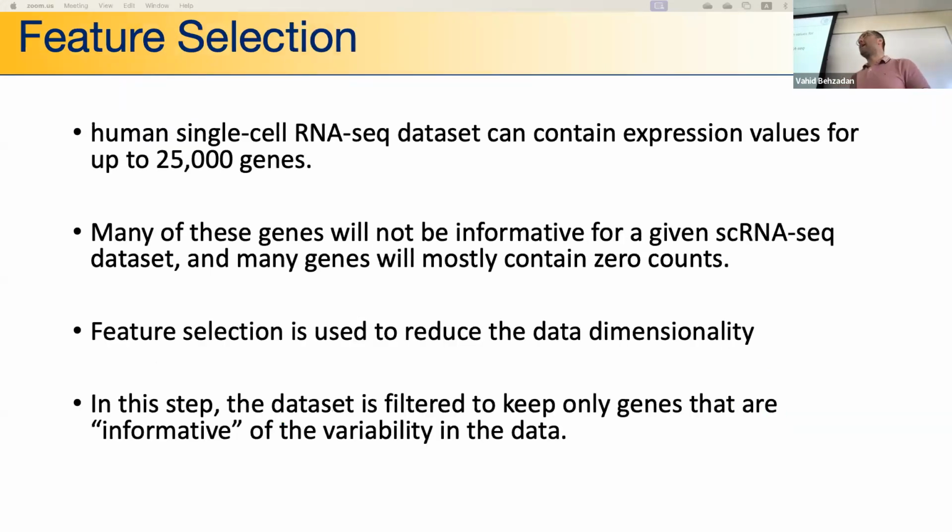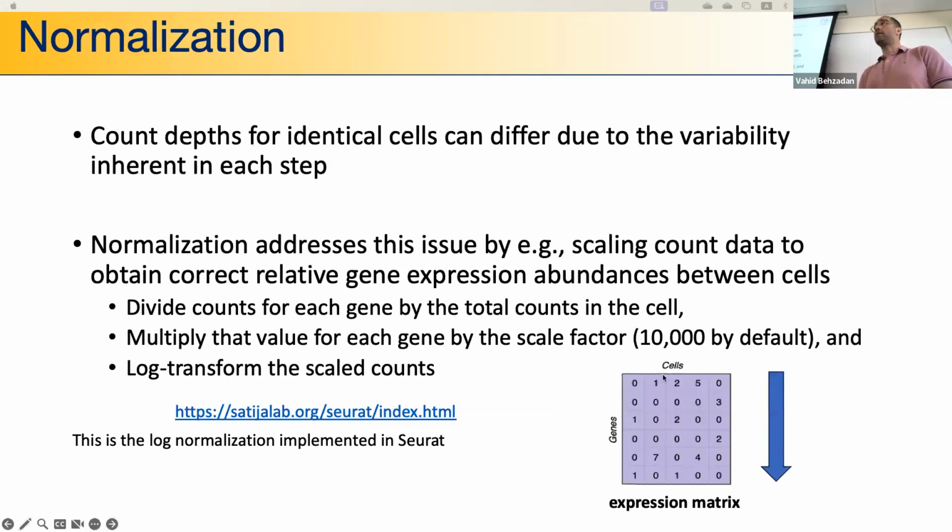Then we try to extract the column. So the sum of the column means the sum over cells, the count of each gene, right? No, cells. A column is a cell. Yeah. When you sum a column, you're summing over rows, right? Yeah. If you have two of gene number 1 and two of gene number 3, and you add them up, are you going to be able to reverse this and say that 4 is two of gene 1 and two of gene 3?